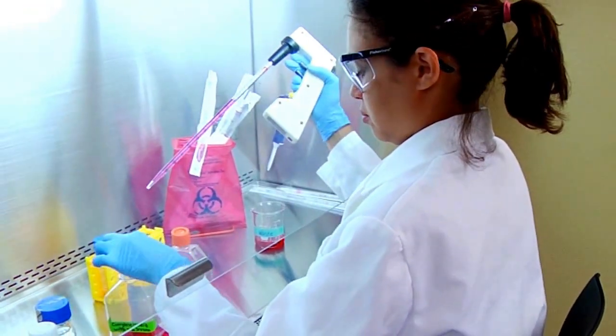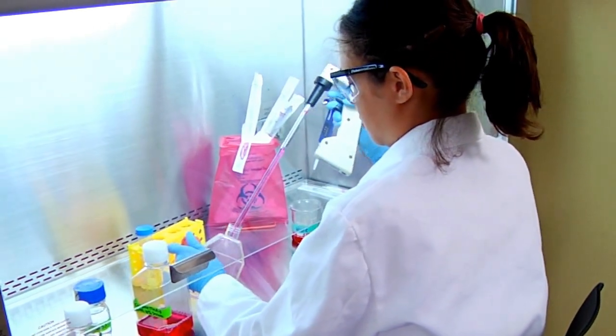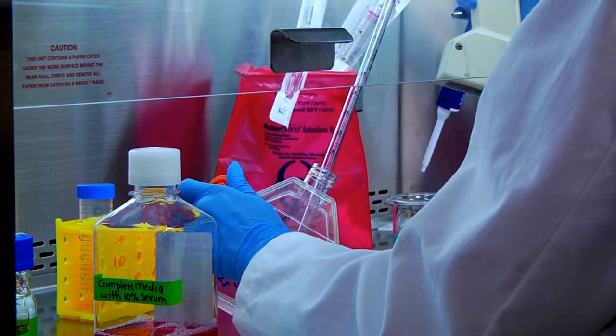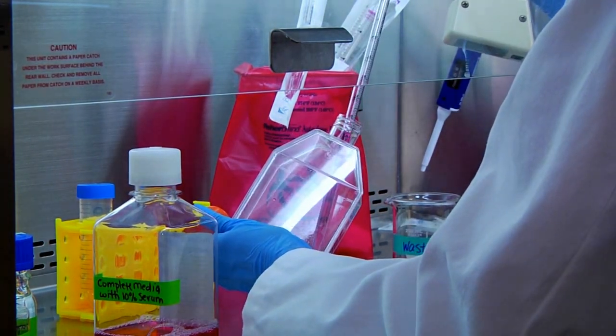Back under the hood, add 7 milliliters of complete culture medium with 10% serum to the trypsinized cells and re-suspend the cells by pipetting up and down several times.